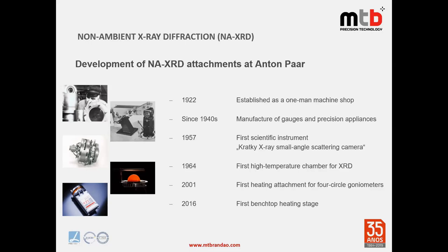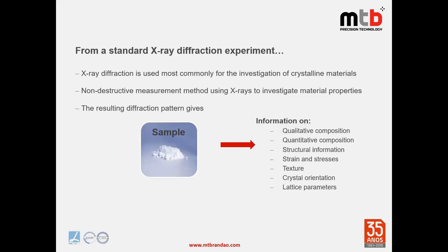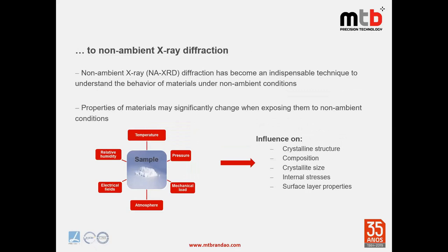In standard ambient X-ray diffraction, we investigate mainly crystalline materials. It is a non-destructive measurement method using X-rays at different energies to investigate material properties. A measurement results in a diffractogram or diffraction pattern, which gives us qualitative and quantitative information about the sample. Non-ambient X-ray diffraction adds another dimension of information by changing external parameters during the experiment.